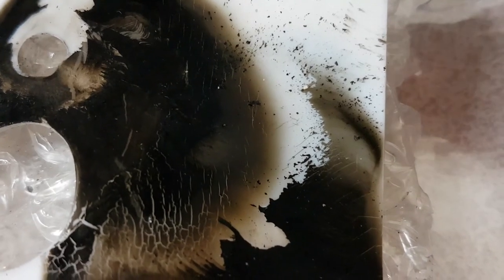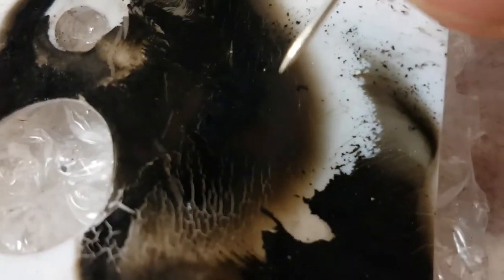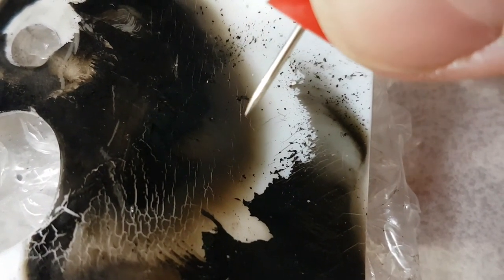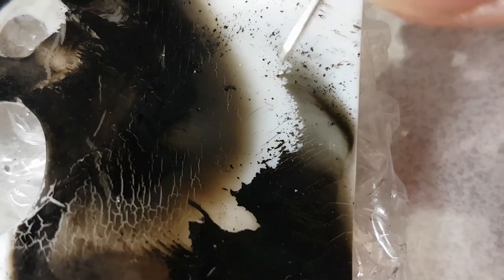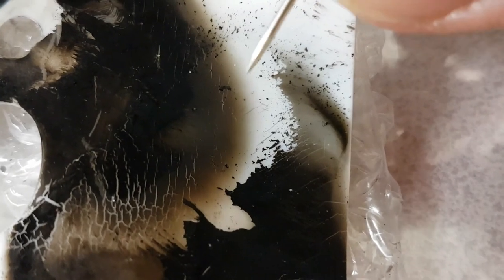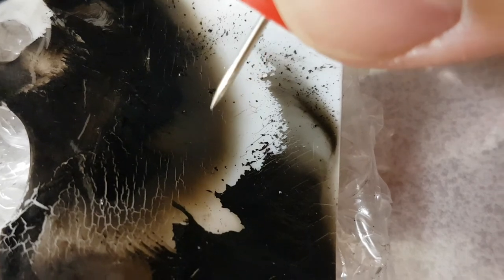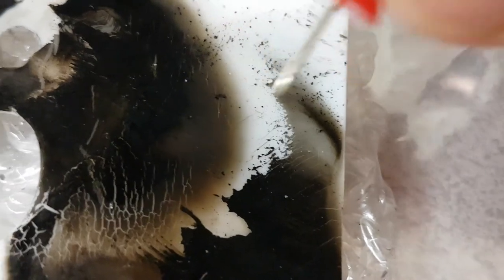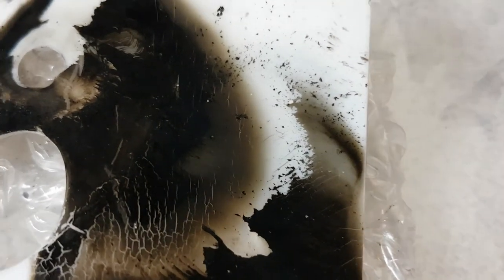Okay, what we are looking at in the coming microscope video is the area of the PTFE between this dark area here, this grey-brown into the white zone. This is relatively unscathed. This area has a transition, and then a very dark area. This is where the Amazagas flame momentarily contacting the PTFE caused this deposit.